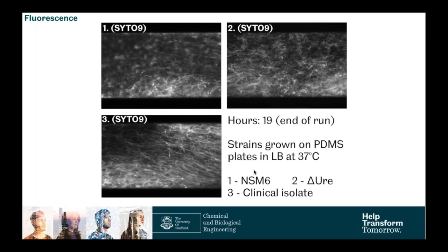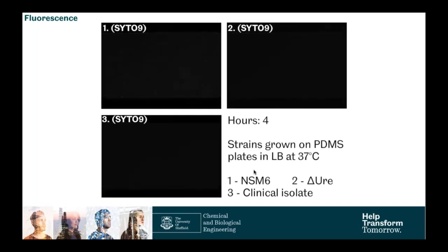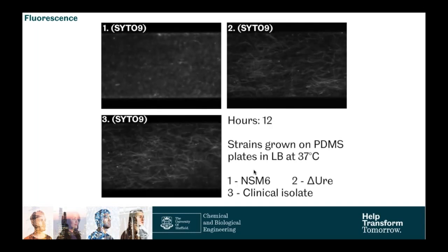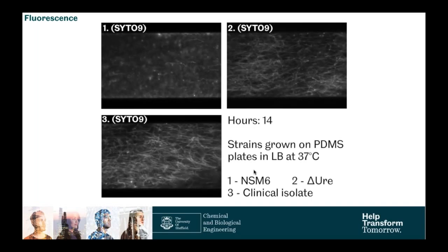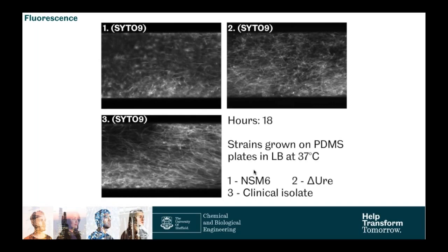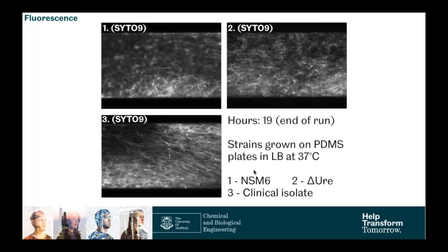In number one, you've got the formation of this higher structure at the bottom. And then you can really see, I think, on number three, this flow region through the middle. You've got kind of a biofilm forming at the bottom and at the top, so on the bottom left and the top right, and then this flow through the middle, which you can see as the swarmer cells elongate and you see the flow through there.